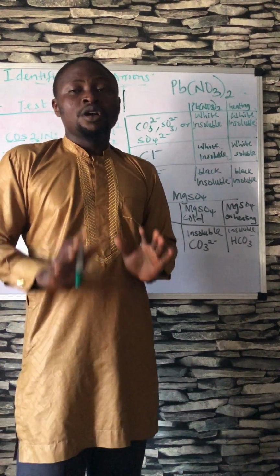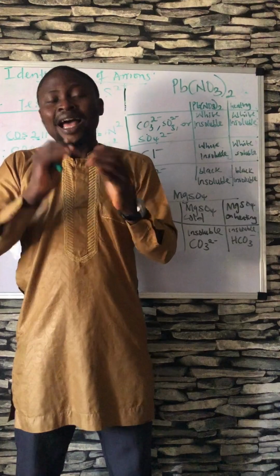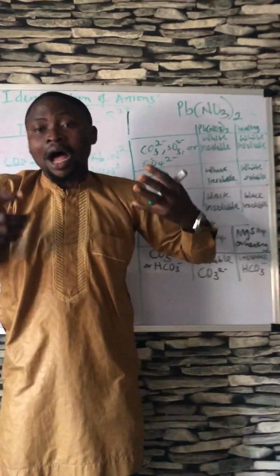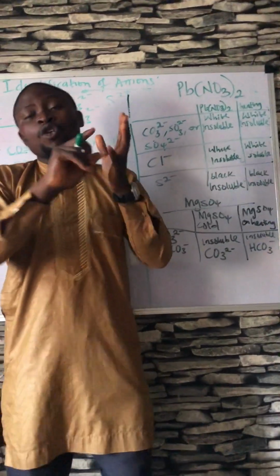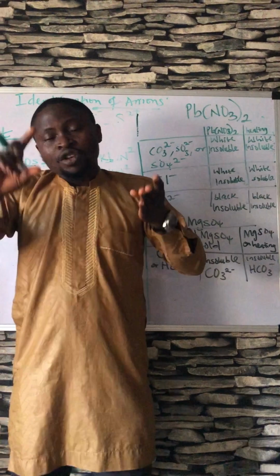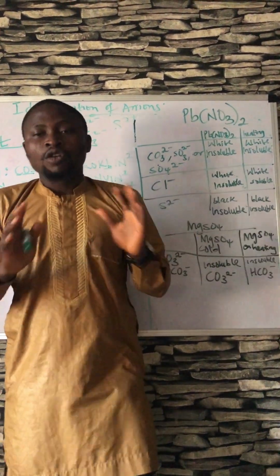So these are just the last 2 reagents, the lead nitrate and the magnesium sulfate. Remember, as for the anions and their properties, we looked at SOCATOA.